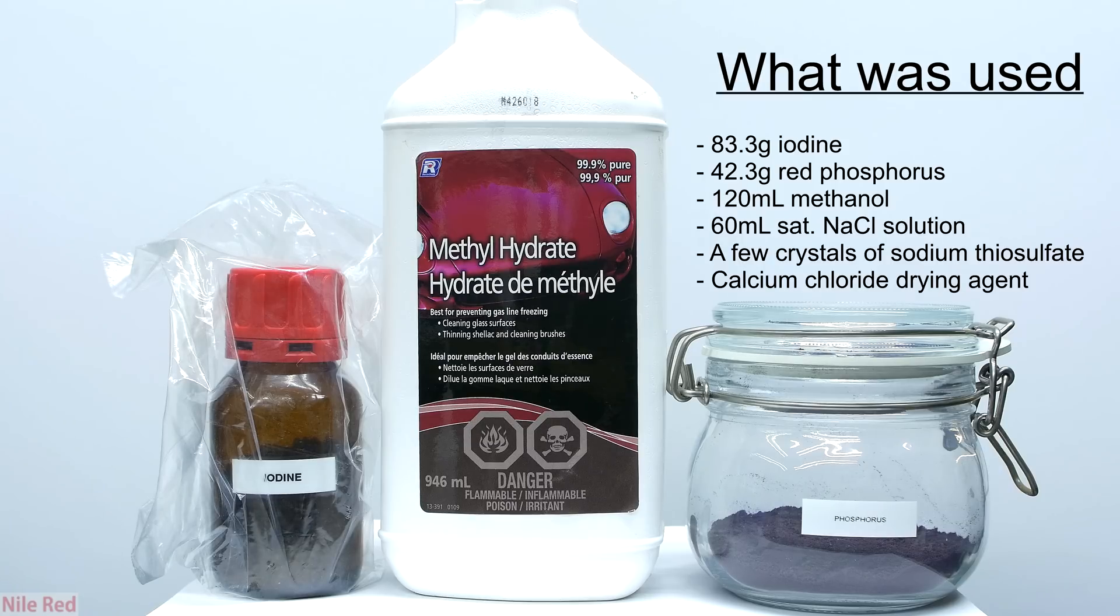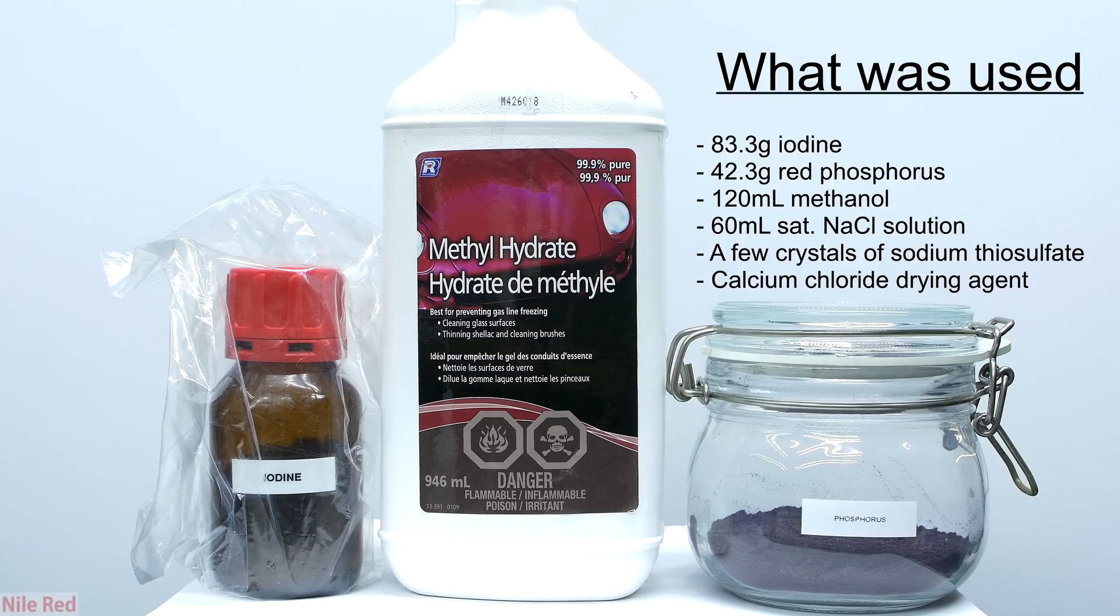Red phosphorus is pretty valuable, so 42 grams seems like a lot, but you should be aware that most of it is recovered at the end of the reaction.